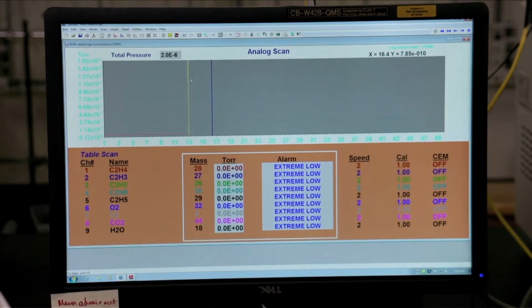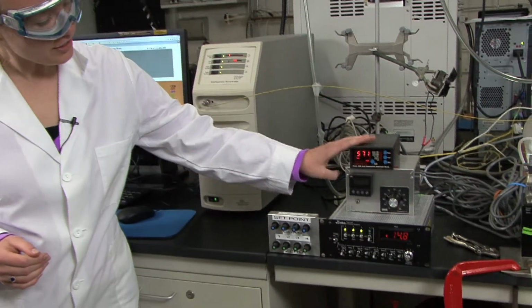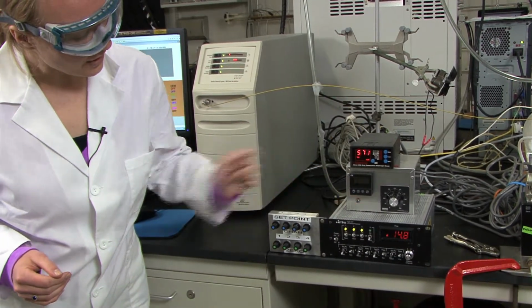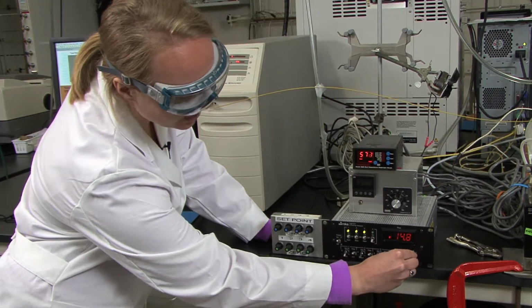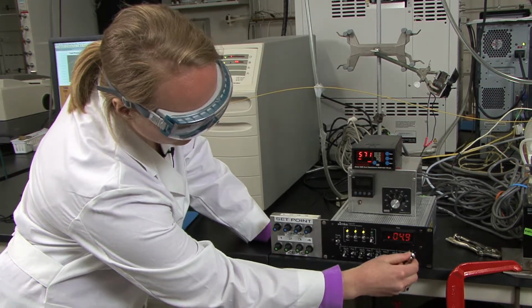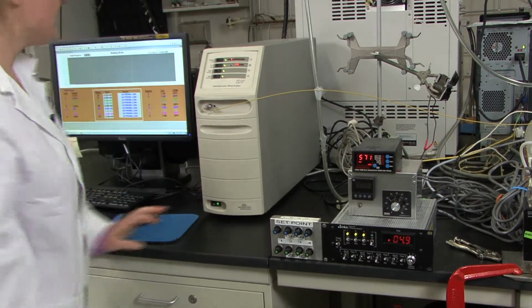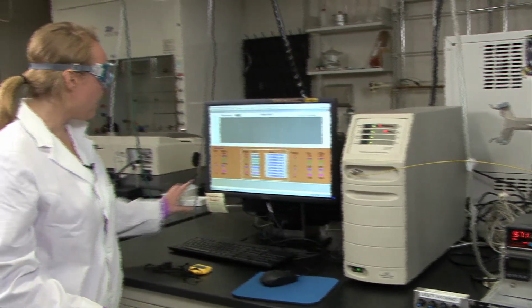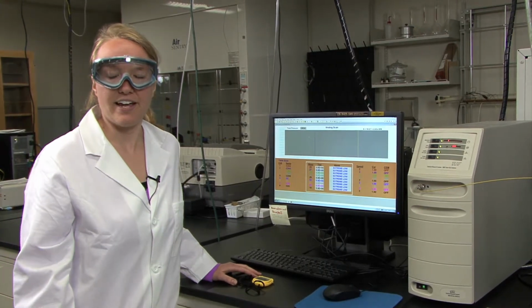And then at the end of your scan, you'll need to keep track of the total pressure, the temperature, and then the actual flow rates of all of our gases. And we can check those by just flipping the channel display readout. Okay. And this will need to go for 6.5 minutes, and the CO2 level should be pretty low, in the range of E to the -9th again.